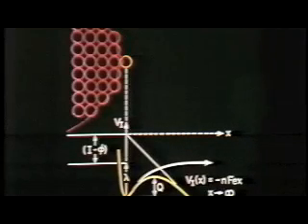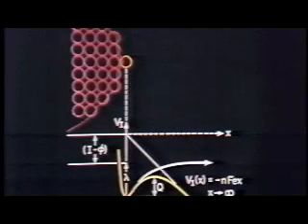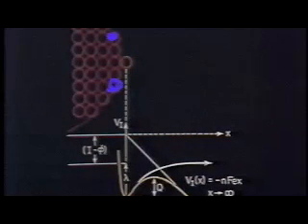Okay, the way in which that effect occurs is if we looked at that lattice from the side in cross-section, we would see these individual atom rows. The electric field would be the highest at these edge atoms, or any protruding atom that appeared on the surface, and by applying an electric field, we would lower the potential energy barrier and then thermally activate, by normal thermal activation processes, an atom over that surface.